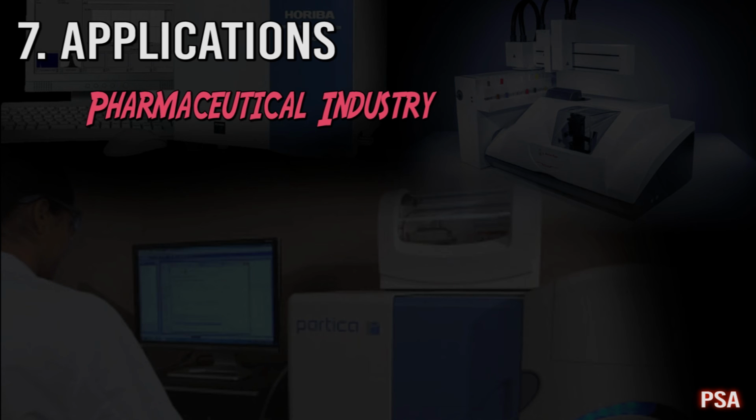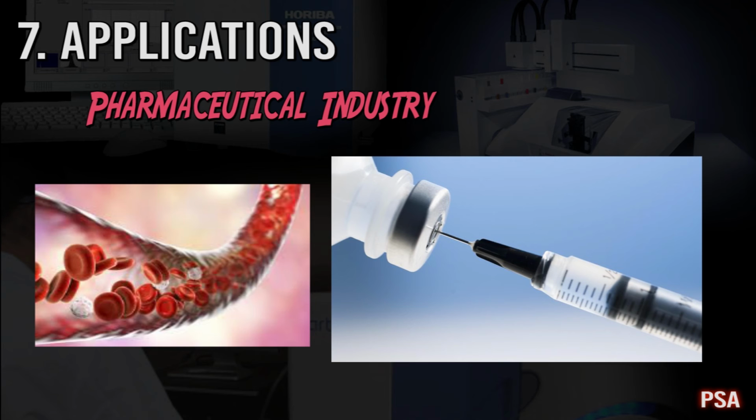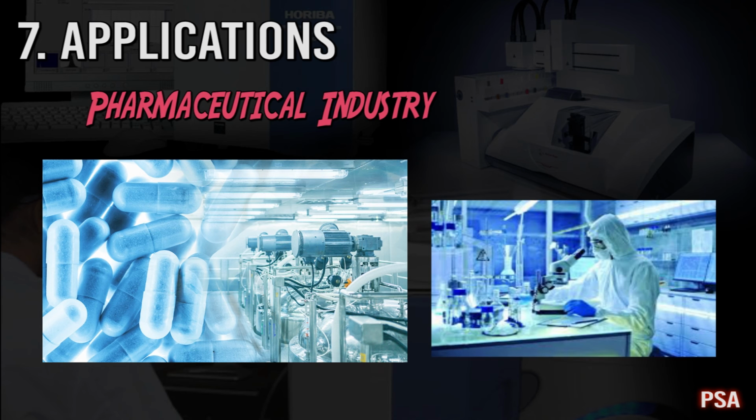In the case of microscopic components in medical injection, the use of a particle size analyzer allows the professionals to figure out how they pass through or penetrate capillaries and blood vessel walls, and which part of the body they reach. Monitoring the behavior of the particles gives a major contribution to the efficacy and side effects of pharmaceutical products, wherein the pharmaceutical industry uses this information when designing a new drug.